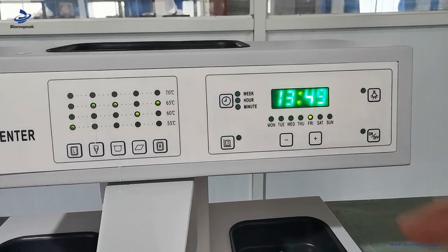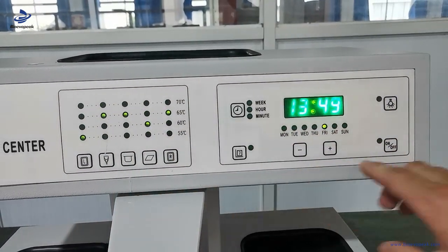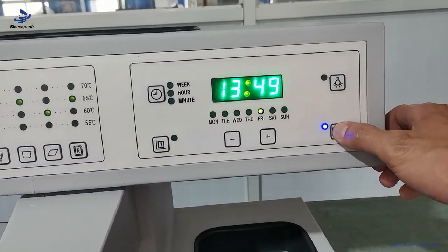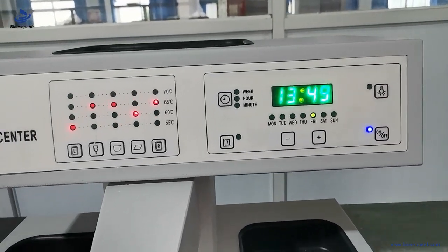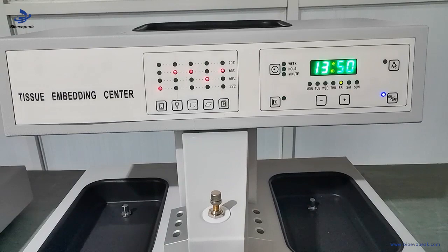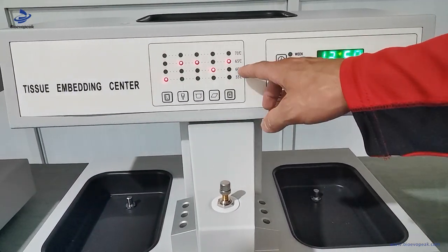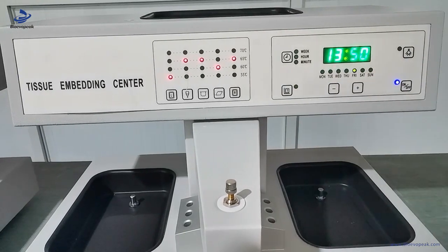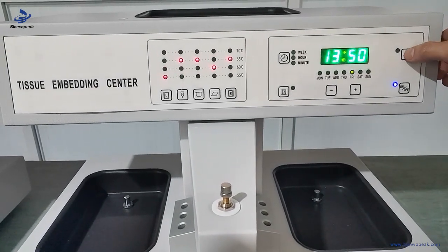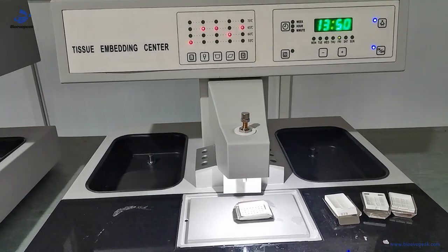When you have set the temperature for each part, press this on/off key. Every part of the machine is now working. You can see the red light for each part, which means each part is working. Then press this key — this is the lighting for the working table.